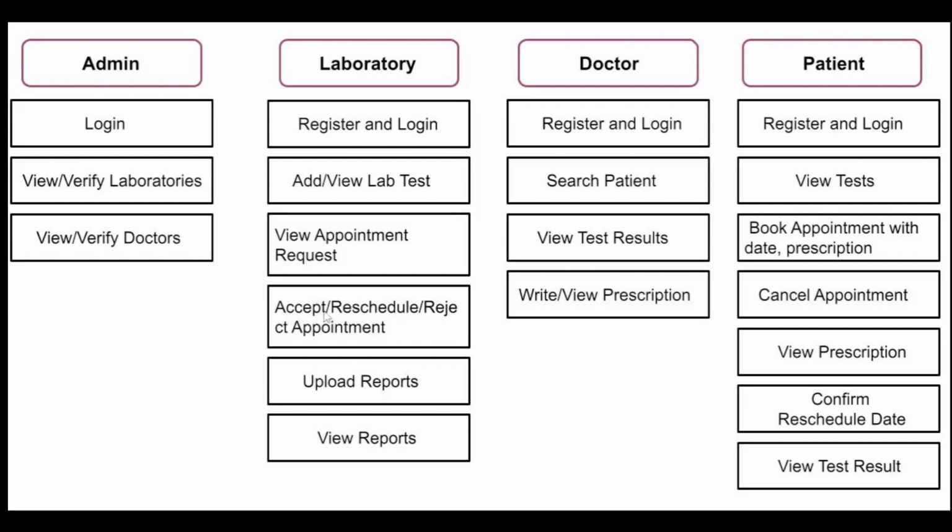When the request is accepted, physically they run the tests, and the laboratories will upload the reports of the test results for that patient. These records will be saved here. Patients also have the privilege to cancel their appointment, but only before it is accepted by the laboratory. After that, laboratories upload the reports of the patients.